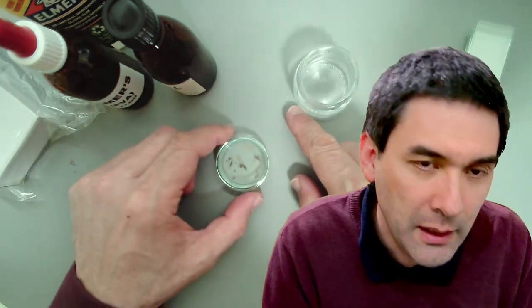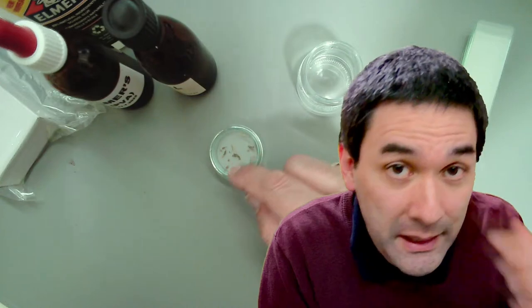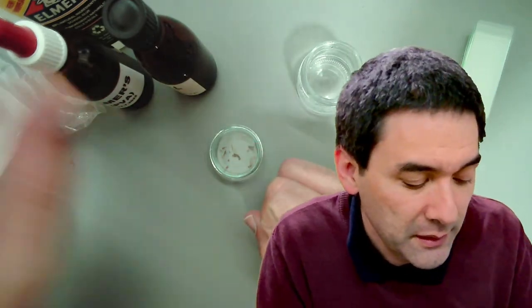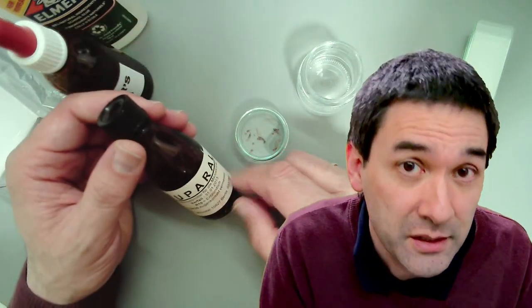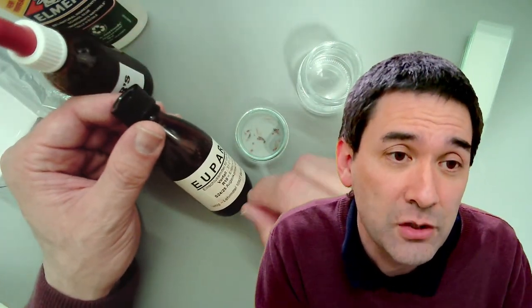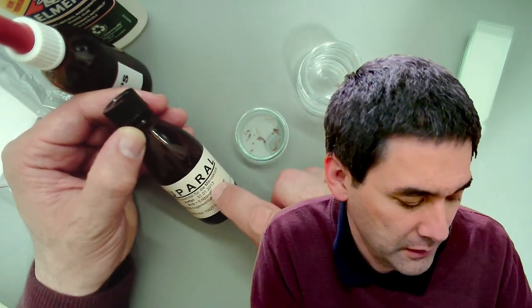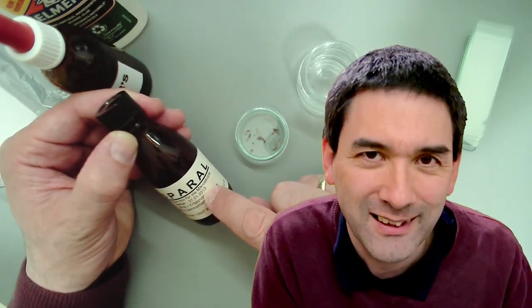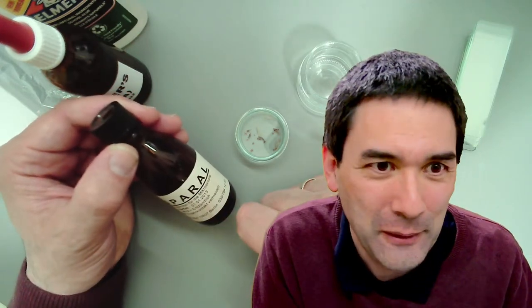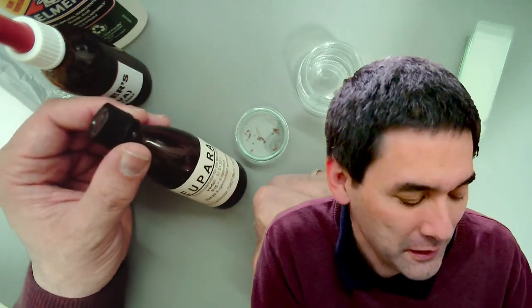And if you want to mount insects, like the wing of a bee, or in this case also mites, arthropods, then there is another mounting medium that is recommended, or at least it's been customarily used for a very long time, and the name is Euparal. Now, I bought this bottle a long time ago, and there is a due date. It says use before 2013. It's 10 years overdue, okay? However, it still works. I bought this maybe 15 years ago.